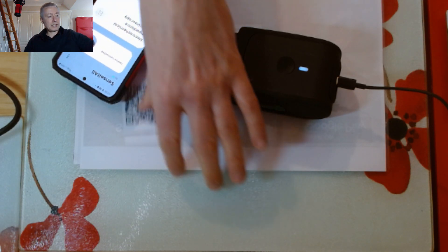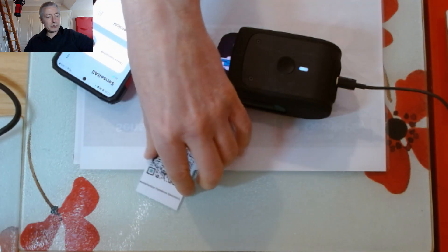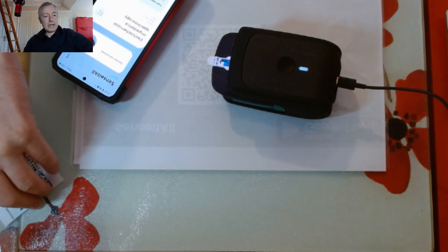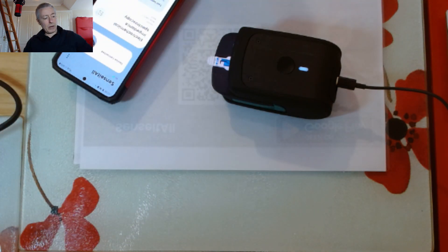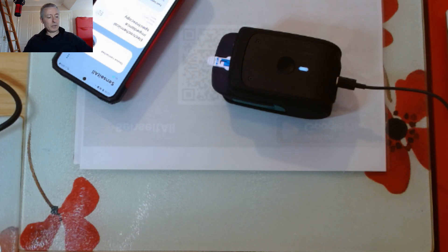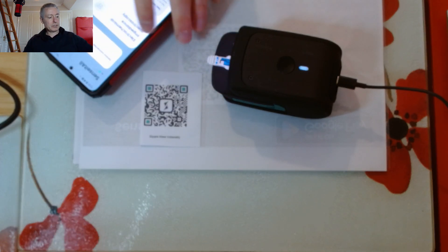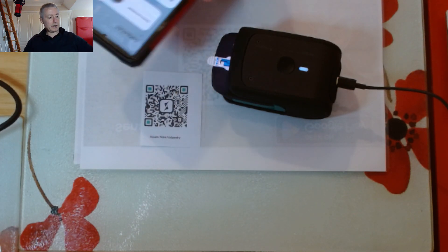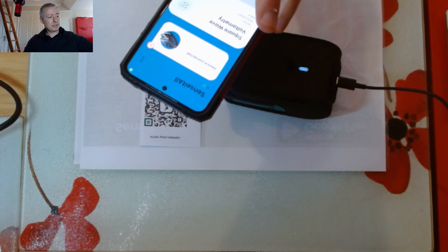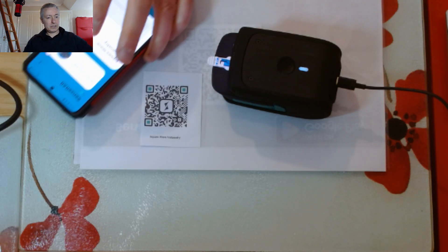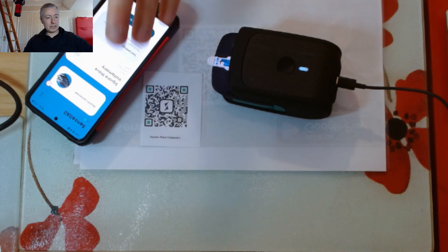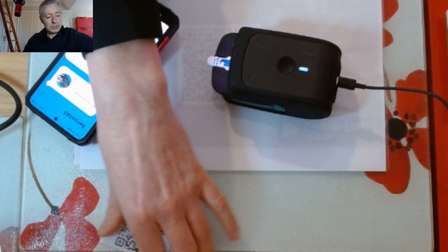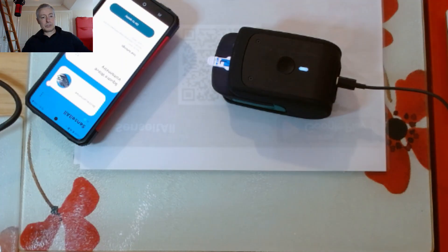If you want to do square wave voltammetry, we have a QR code for square wave voltammetry. I'll just bring that in and scan that, so now that is doing square wave voltammetry.